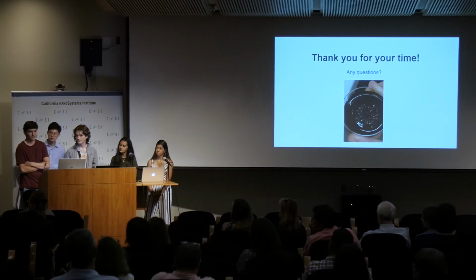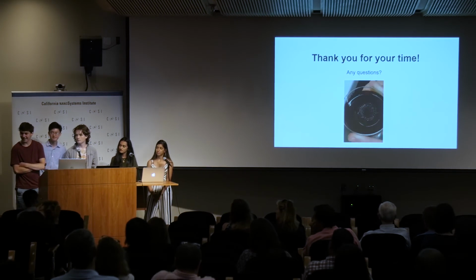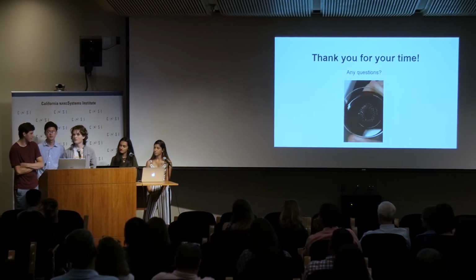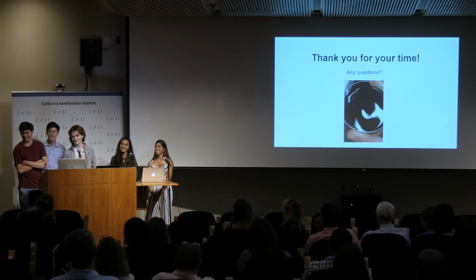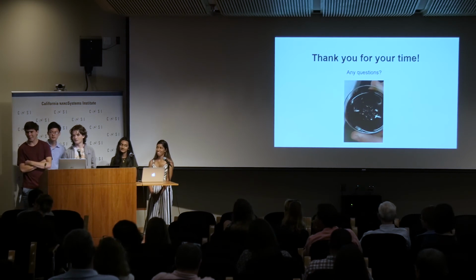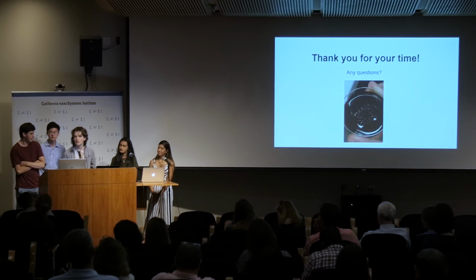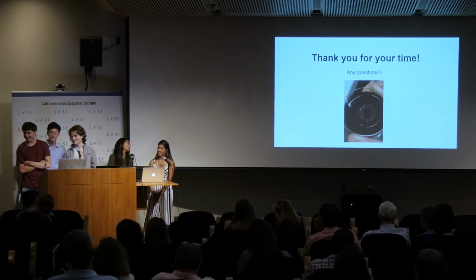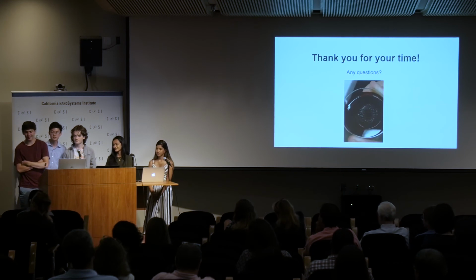Okay, so when you're talking about synthesis, here's your quick lesson. You said you used FeCl2 and FeCl3. What was their goal? Why did you use them? We needed the iron. They're just a source of iron. So when you're saying something, we used FeCl2 and FeCl3 as a source of iron. Yes. And then used ammonium hydroxide as a source of? I'm guessing oxygen, but I don't fully understand. The hydroxide is OH, and it takes the oxygen from the hydroxide. So that's your source of oxygen to make iron oxide.